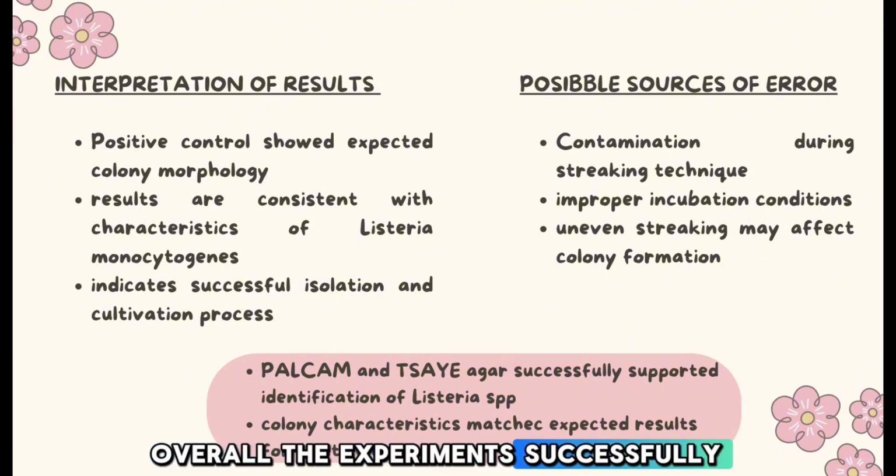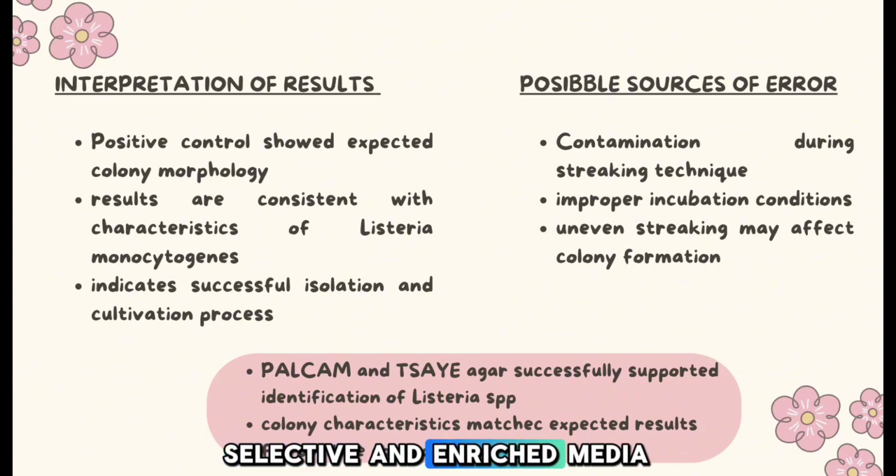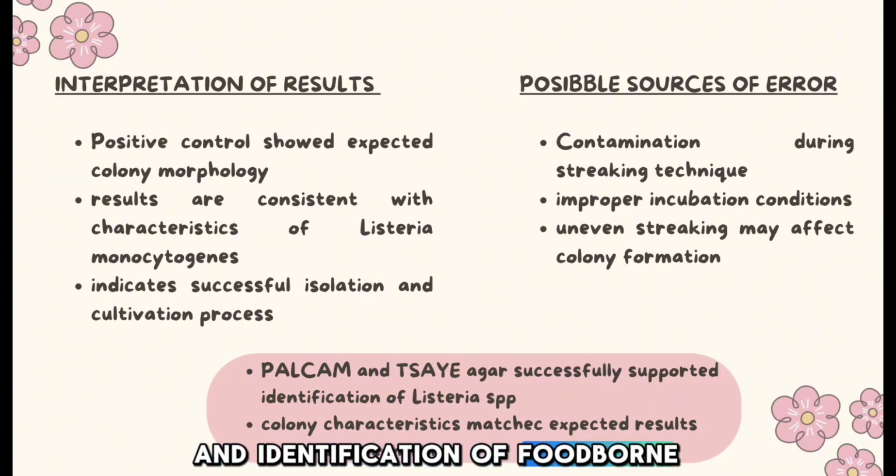Overall, the experiment successfully demonstrates the growth characteristics of Listeria on Palcam and TSAYE agar, showing that selective and enriched media are important for the isolation and identification of foodborne pathogens.